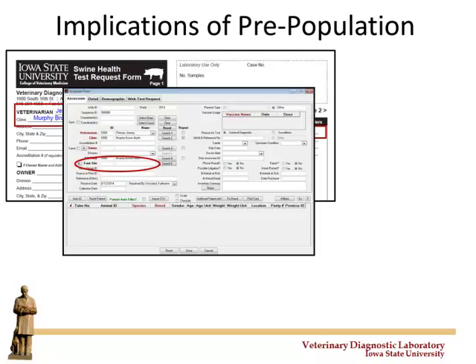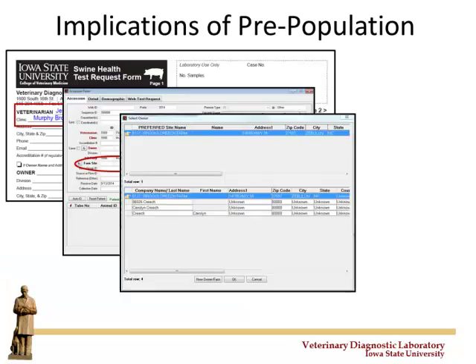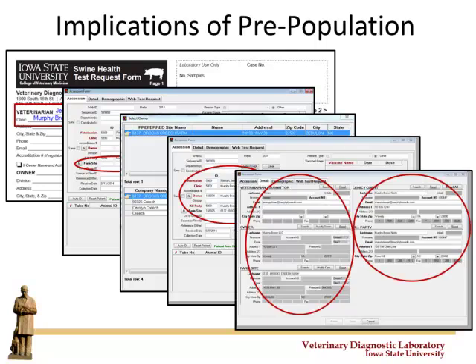And then what happens is when they get to here, this is the case entry screen that the clerical staff is seeing when they're going to accession the case. If they've been preloaded, then it's go to this thing up here that's called preferred, and it'll have all the sites just for that owner, in some sort of order. And it's kind of a type ahead. So in this case, when he started typing 6137, that pops up. They click on it, and it populates that, and then pulls all the correct information with that site up into it. Does that make sense?